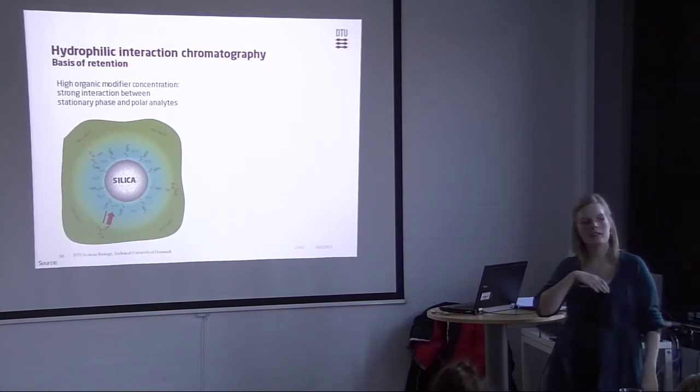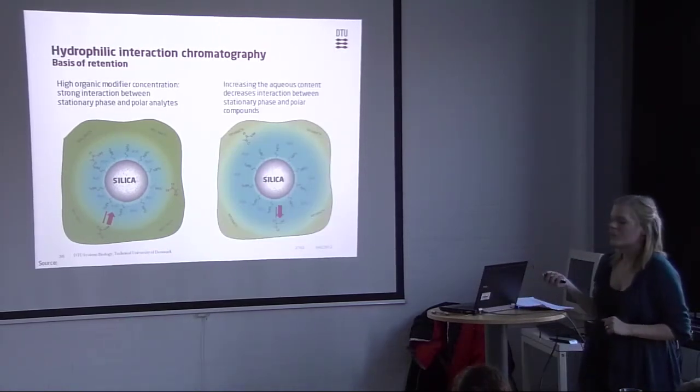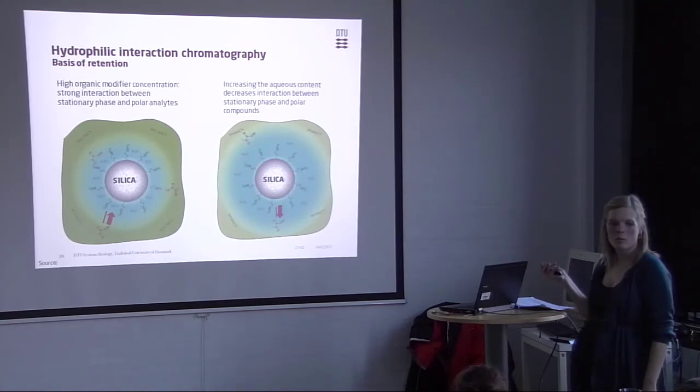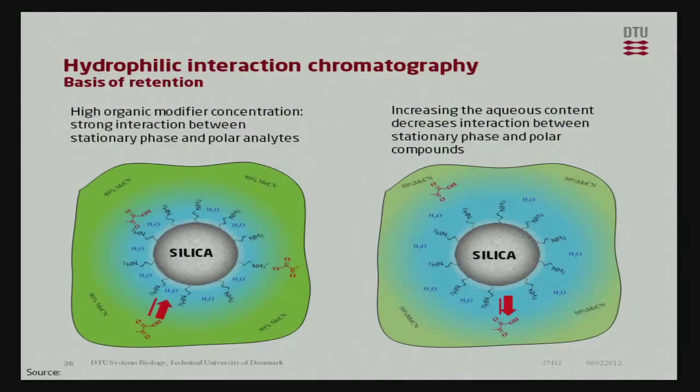So when you want your compounds to leave the column in HILIC, you increase the water content, because then the compounds can diffuse out from the water layer into the mobile phase and leave the column. So here, this water layer is really essential for how that works. We use water and we use acetonitrile. We don't use alcohols, because when we put alcohols in here, that will confuse everything and make a very weird layer in between, and we have no HILIC effect at all. So the water is the key part of the separation.